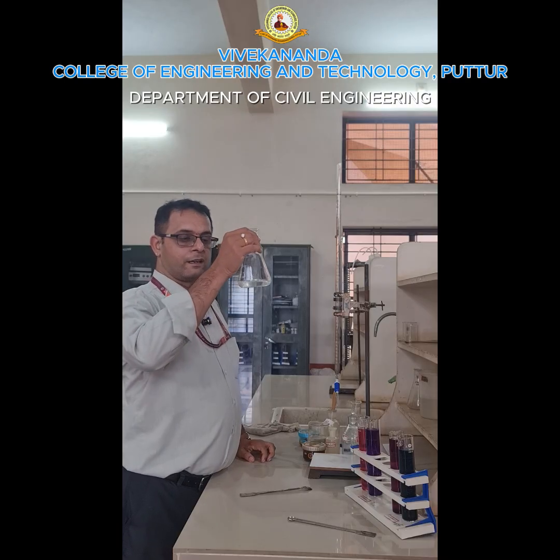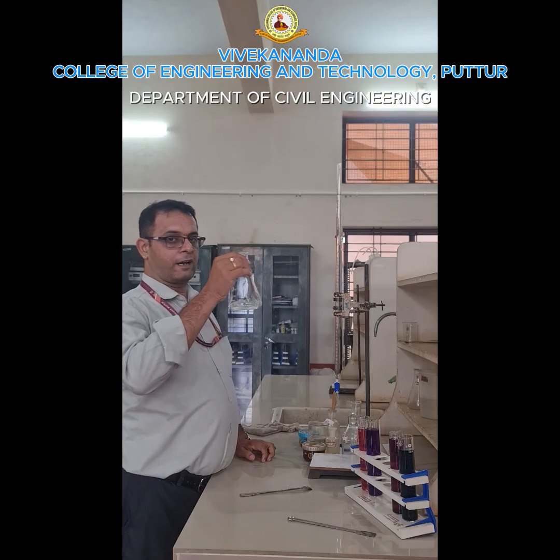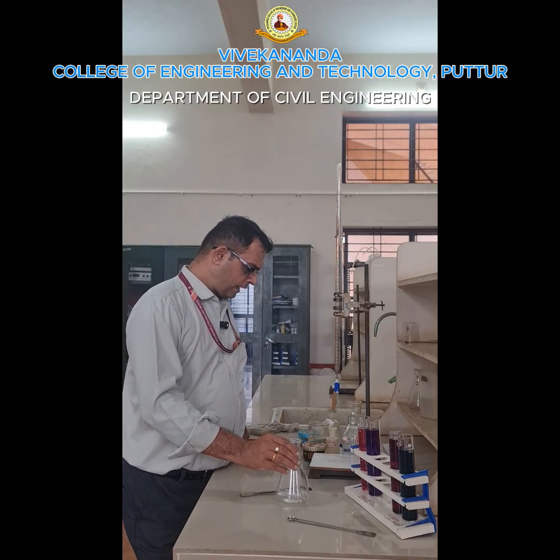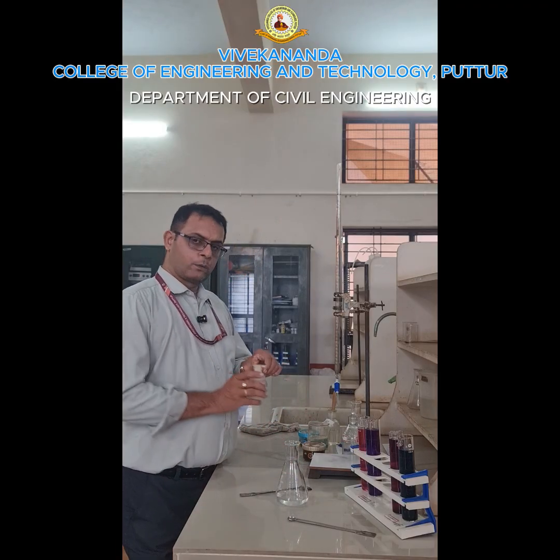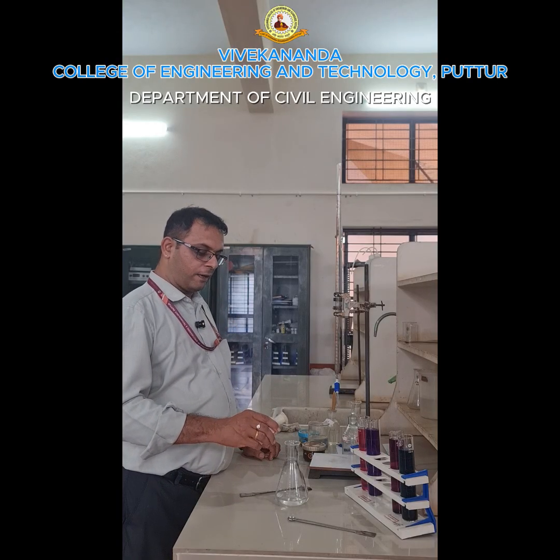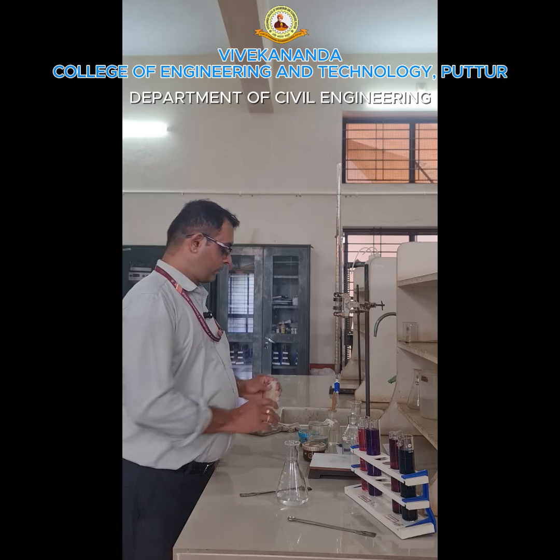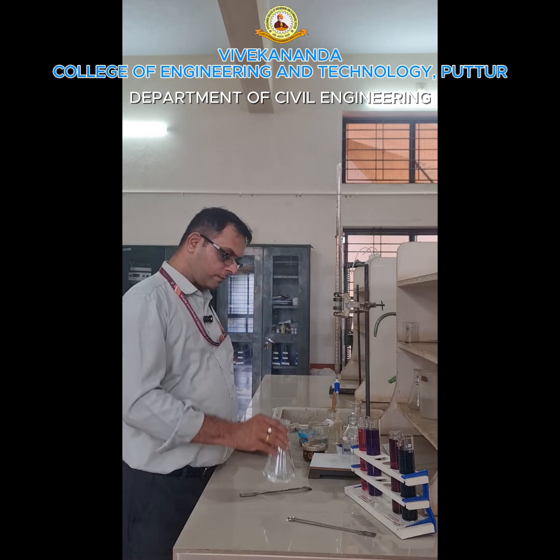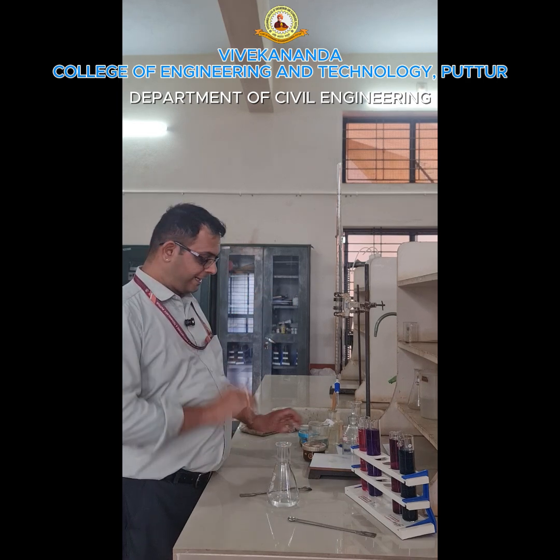Once again, now I will take 25 ml of water sample using a pipette. Then I will add 2 to 3 drops of ammonia buffer. This ammonia buffer will stabilize the pH. So once I add the ammonia buffer, I will stir it. Right. Now we have to add the indicator.